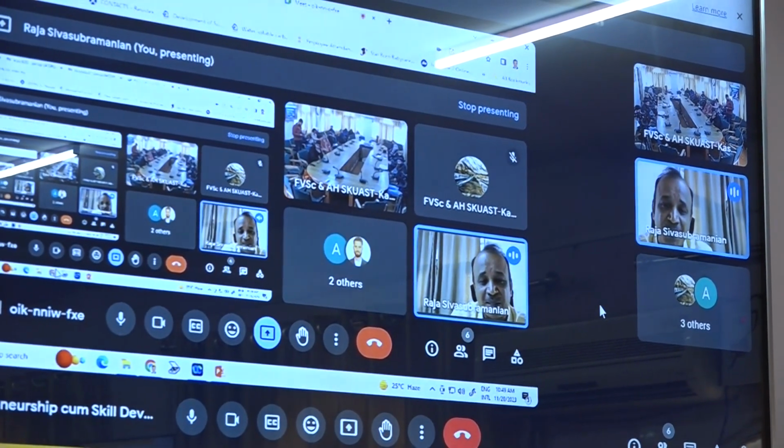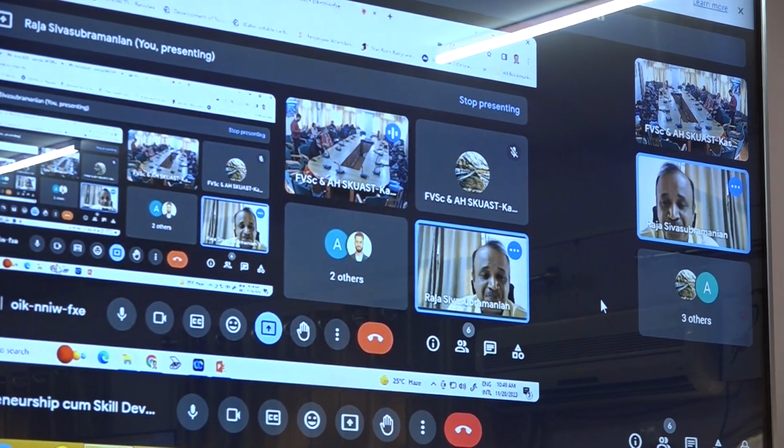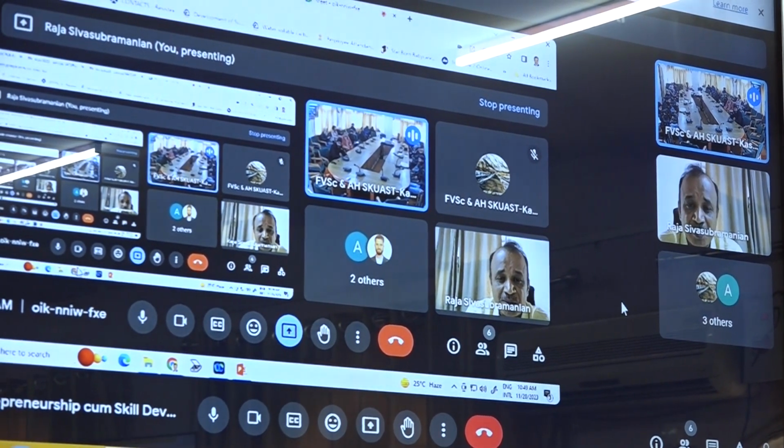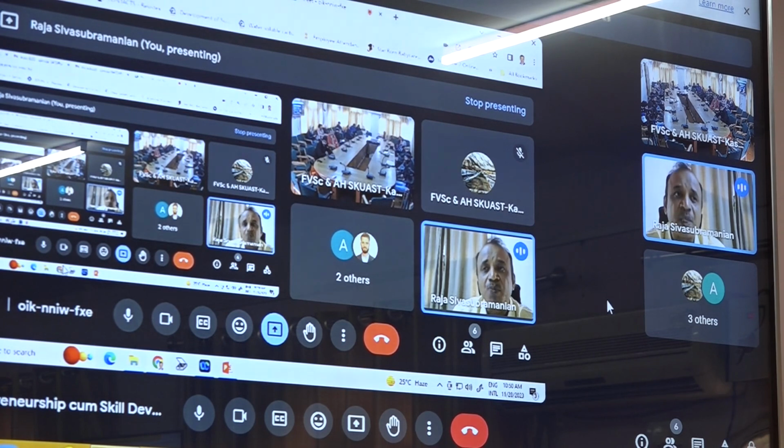Sodium hypochlorite is exactly precise. Some of the other fibers, like polyester, suppose you are using strong sodium hydroxide, then some portion of the polyester will also dissolve. In that case you will get a false result. Suppose Pashmina is blended with another fiber, with sodium hypochlorite only Pashmina will dissolve. That's why the standard method uses sodium hypochlorite. Is it ISO or BIS? Both methods exist, ISO and BIS. That is the standard method if you want to measure the wool content, protein fiber content, or Pashmina.